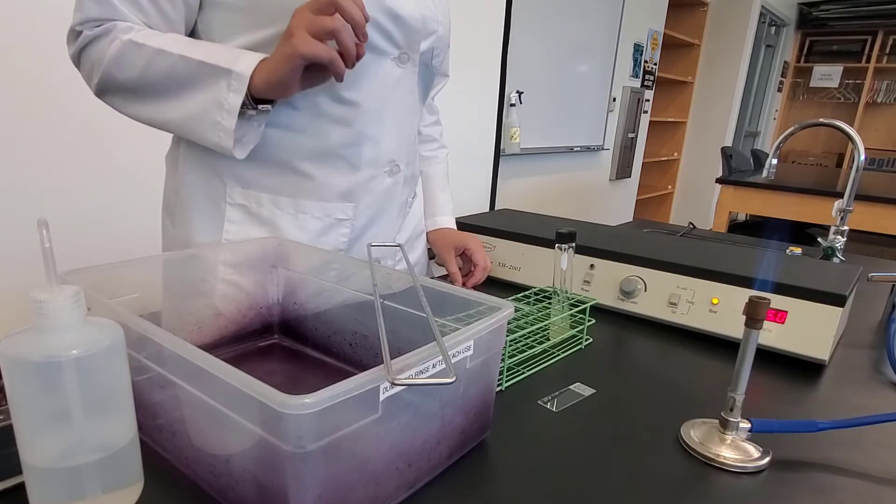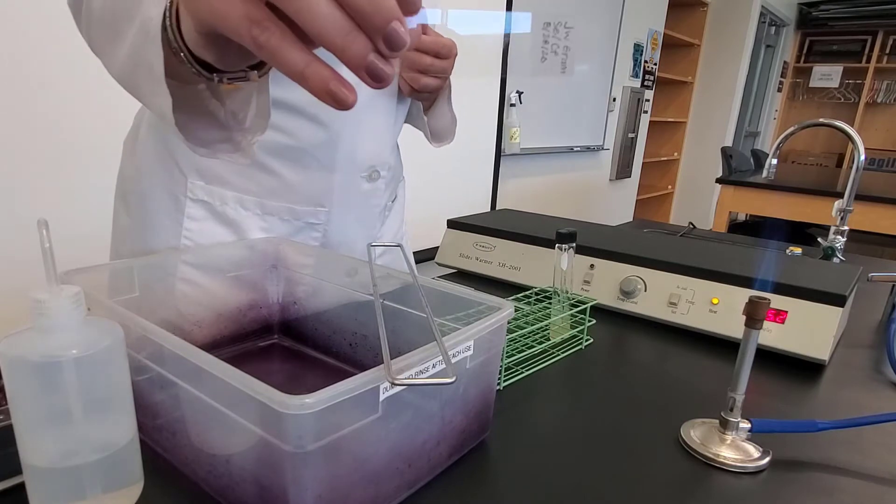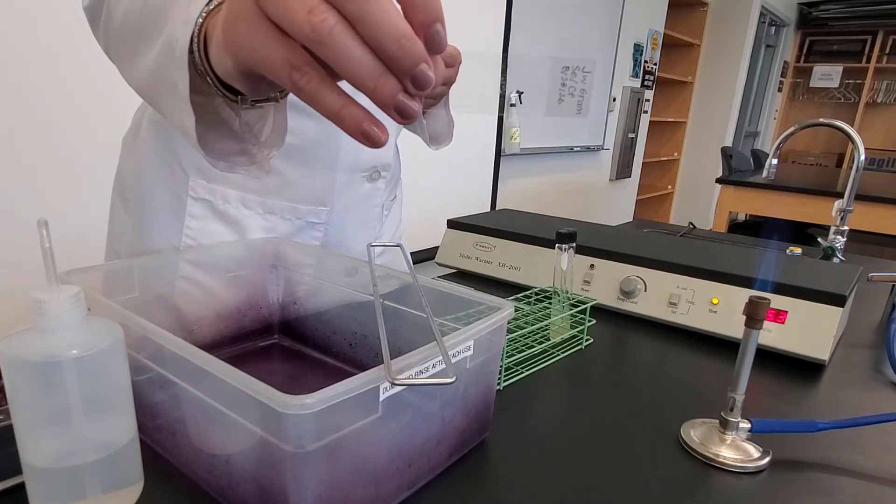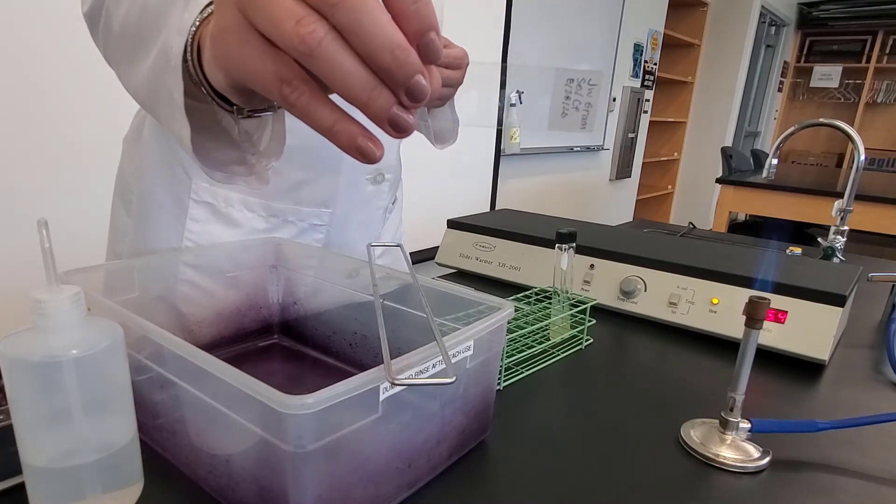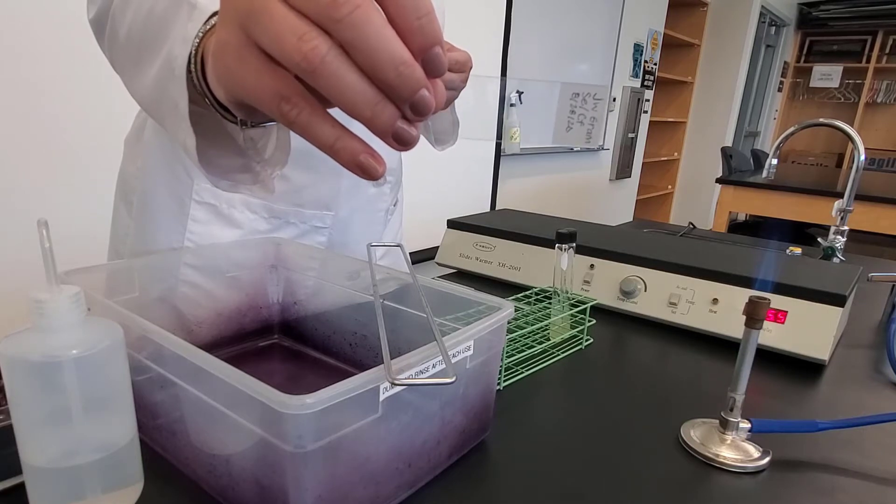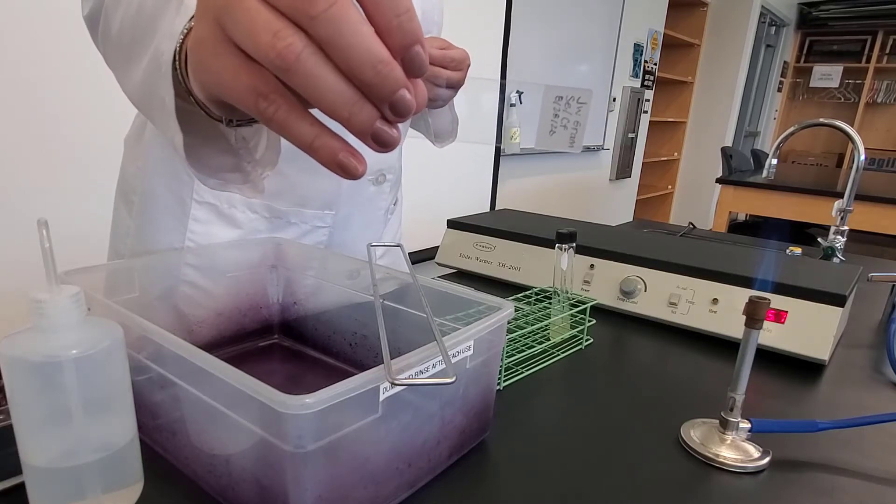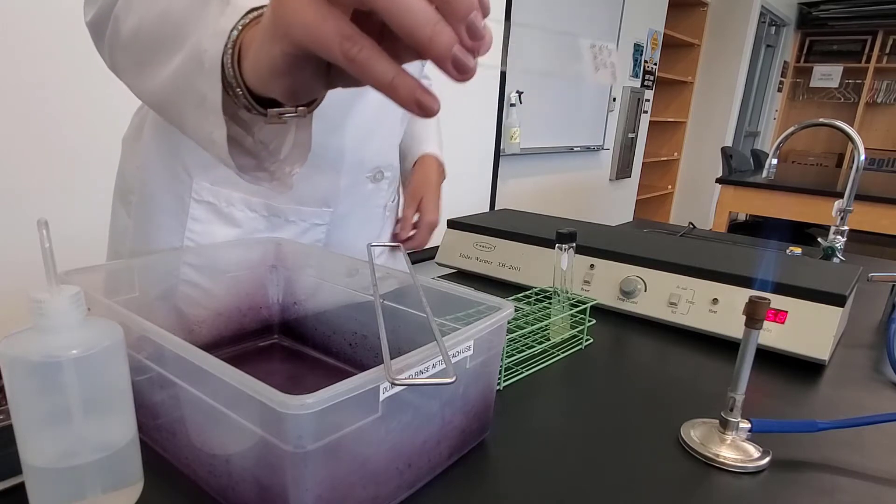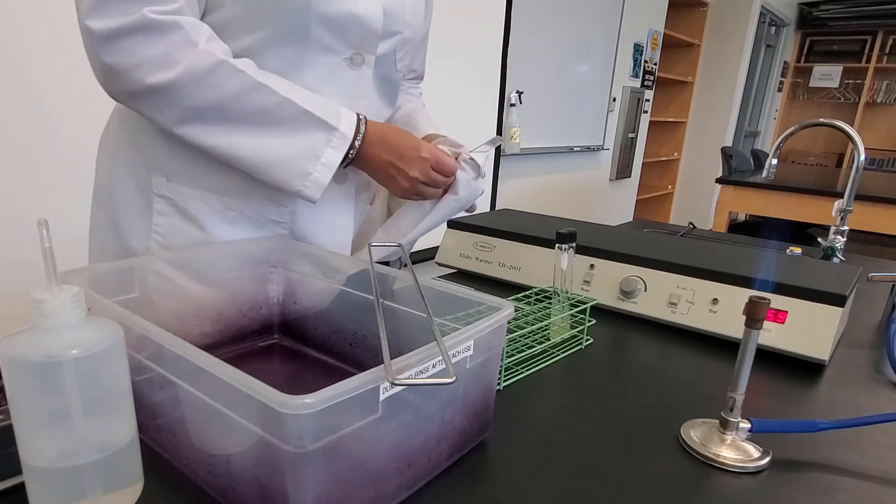To start, we're going to take a slide, and the slide is labeled with my initials, gram stain, S-E-C-F, those are the two organisms we will be using, and today's date. I'm going to just use my lab coat and wipe it clean.